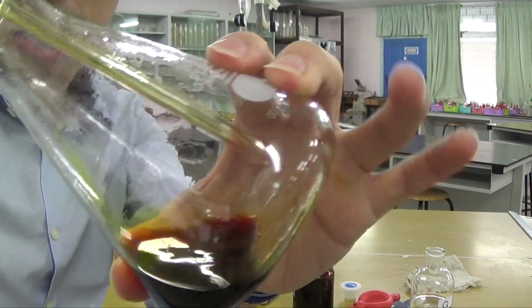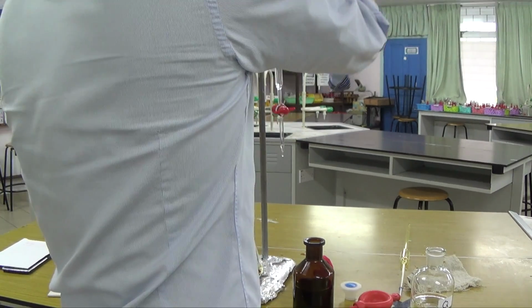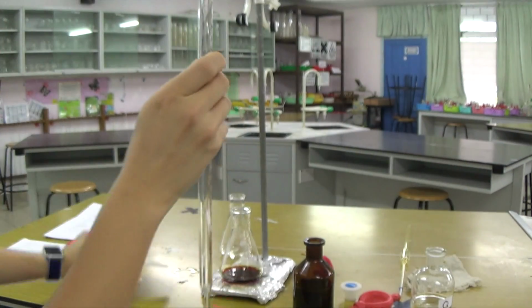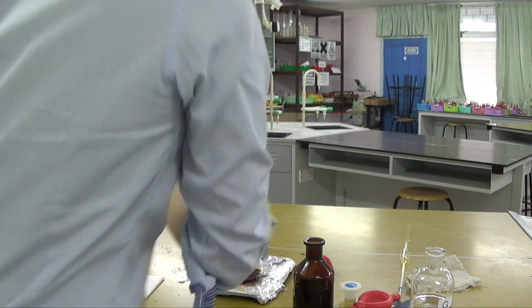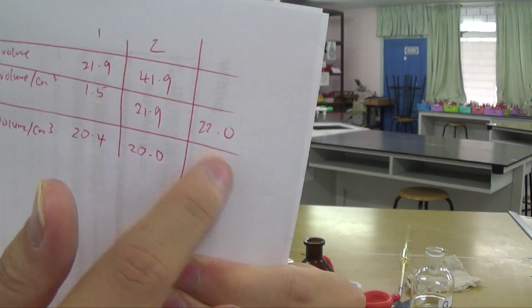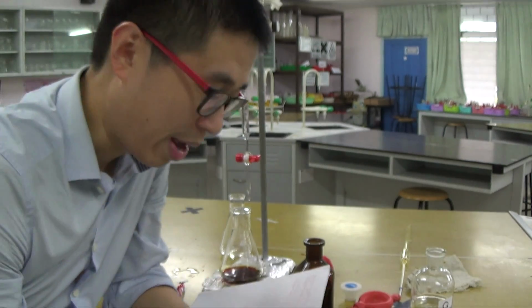Just the last few drops, 1, 2, 3, 4, 5, 6, 7. Okay, where do I start? I start from 22.0. So don't have a white towel all the time, but I start from 22.0 cm cube. So give or take 22.0. My third titer should be the same as the second, because I'm a competent chemist. I'm expecting plus 20. 20 plus that should be 42.0. 42.0 because of the 1 decimal place accuracy of the burette.